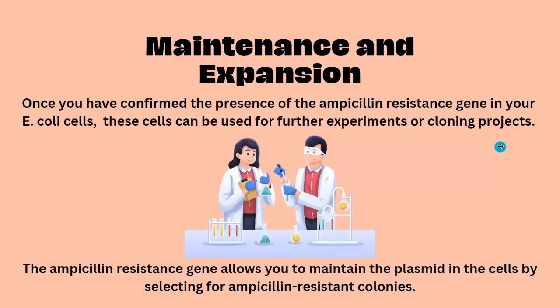And the last step is maintenance and expansion, which is, once you have confirmed the presence of the ampicillin resistance gene in your E. coli cells, these cells can be used for further experiments or cloning projects. And in this case, they used it for analyzing the data. The ampicillin resistance gene allows you to maintain the plasmid in the cells by selecting for ampicillin-resistant colonies.